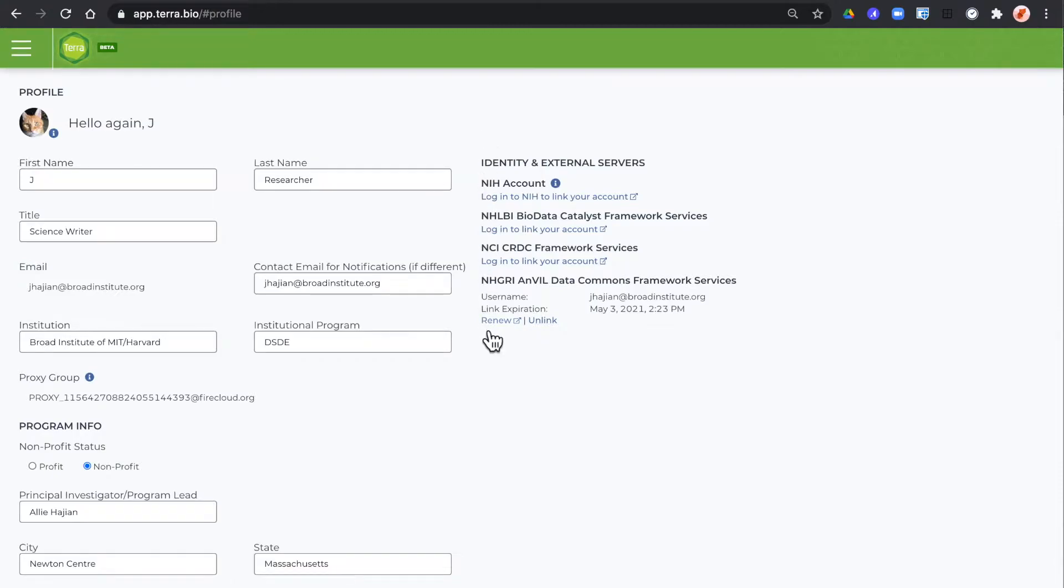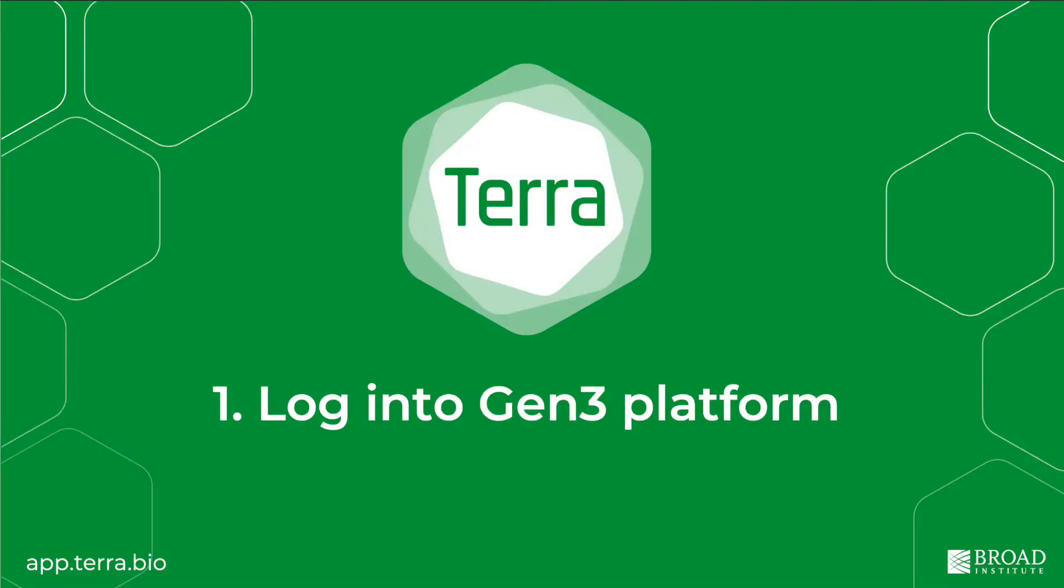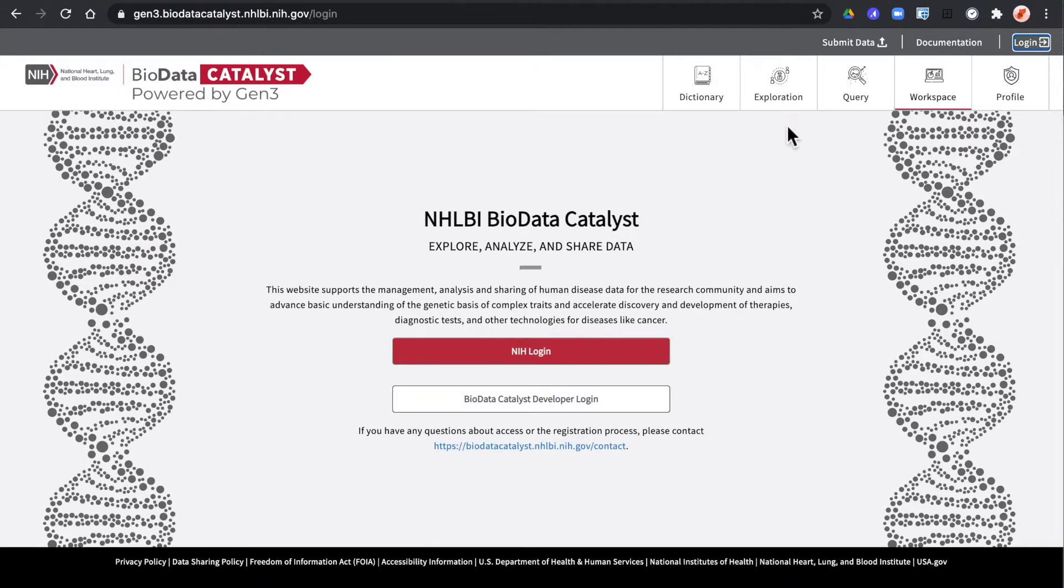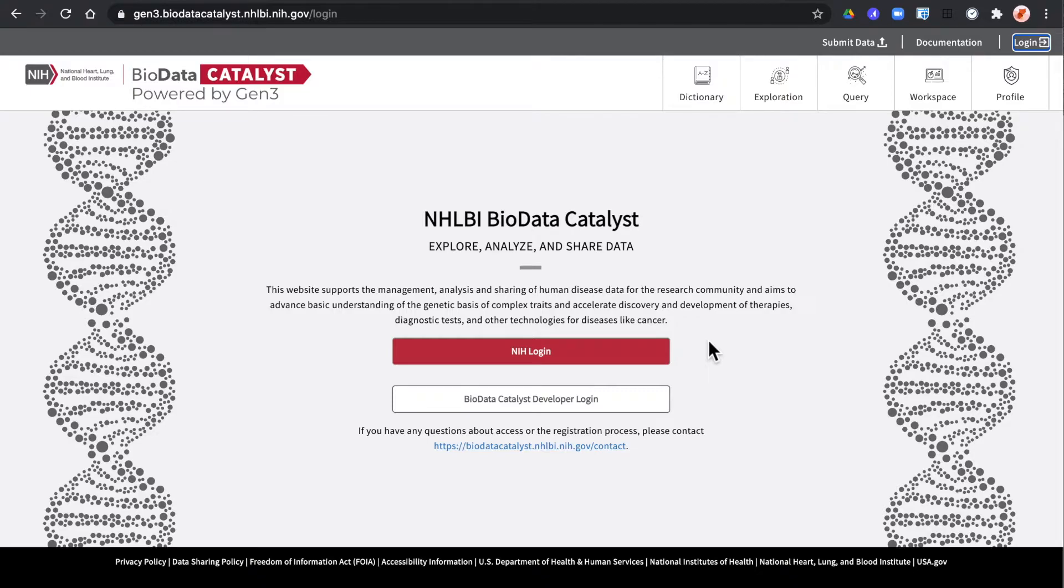Ones that are linked will have the link expiration like this one. If there's no link expiration you'll want to go to the Gen3 platform and log in. Researchers will always want to use your NIH login, the Researcher Auth Services, here at the top.